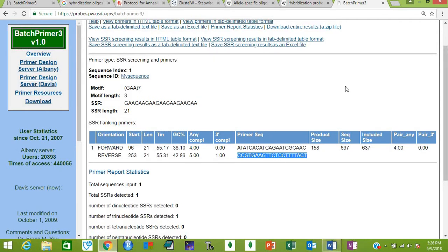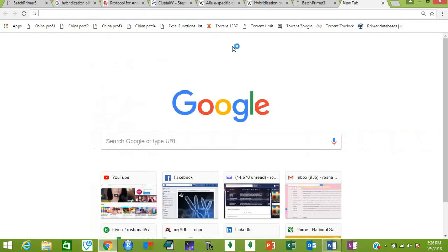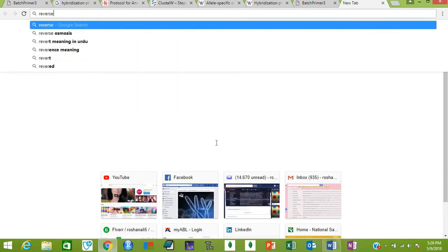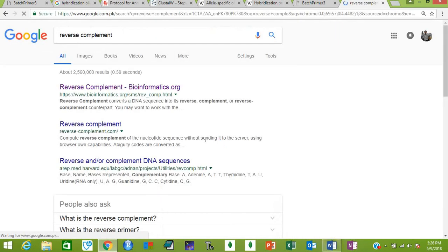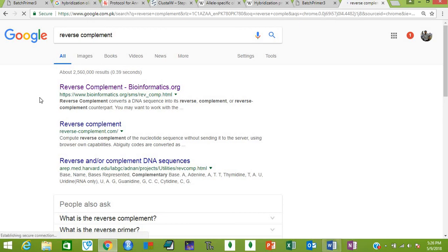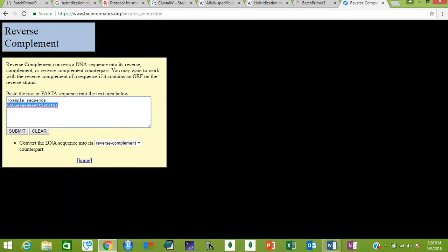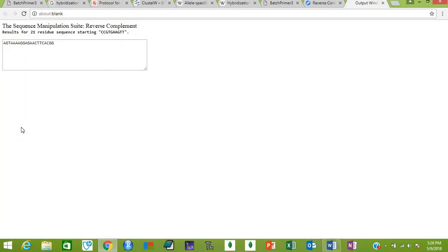For that purpose, go to Google again and type 'reverse complement.' Here is the website. This will find the reverse complement for your sequence. Just paste your sequence here and submit. This is your reverse complement.